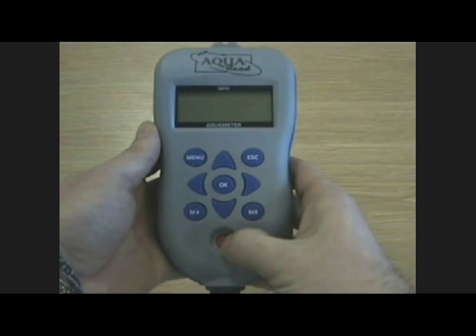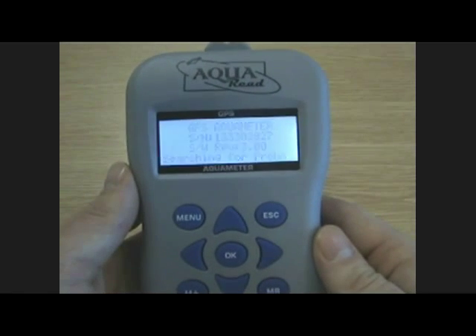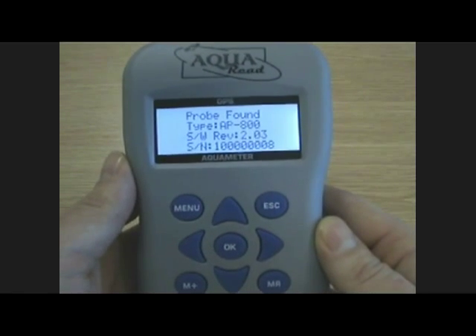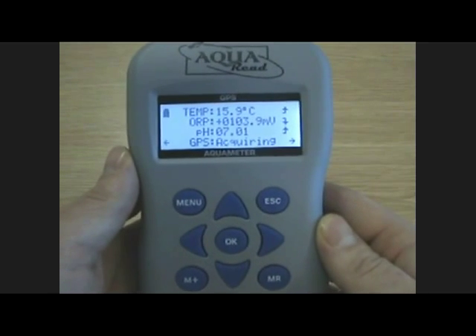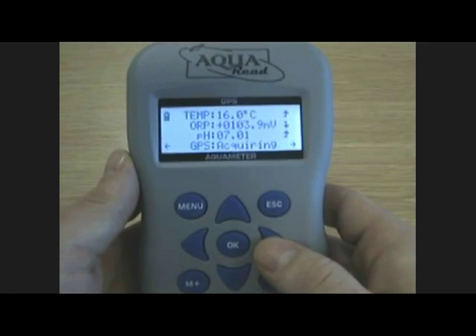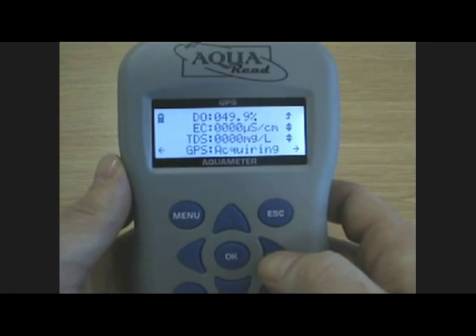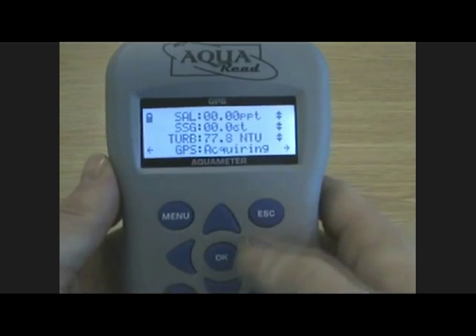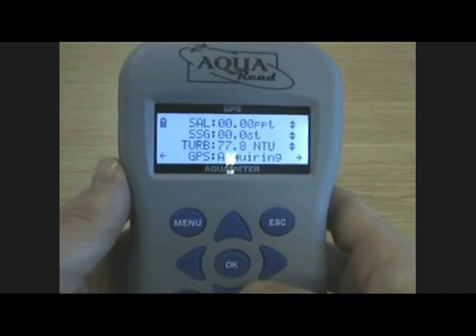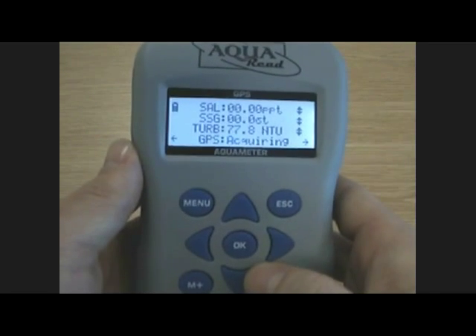The Aquameter is turned on using the red button. It quickly begins looking for the serial number of the meter and trying to detect the AP800 Pro. The system requires no boot up and instantly begins taking readings. Readings are displayed on the screen and can be scrolled left or right to view different parameters. You'll see a trend indicator on the right hand side indicating whether the reading is increasing, decreasing or is stable, giving you an indication of when it's correct to take your readings.